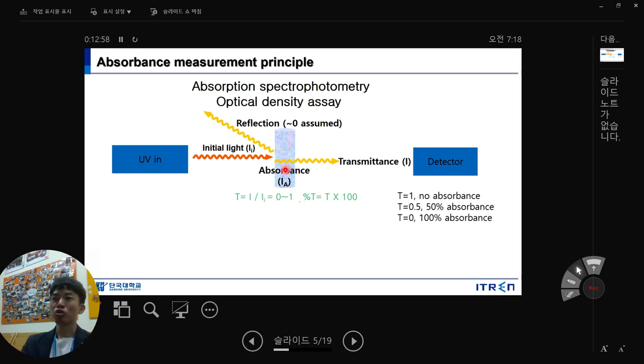And then people wanted to correlate this transmittance to the concentration of your solution, which means color change. But they never found a correlation. That is why they needed another value, like minus log T. Okay? Minus log T, just memorize it. There is nothing more. Minus log T, where T is I transmittance divided by I initial, and then this minus goes to this part and they convert it like this. So just imagine the absorbance value from your spectrophotometer or any kind of UV spectrophotometer: the absorbance is based on minus log T.